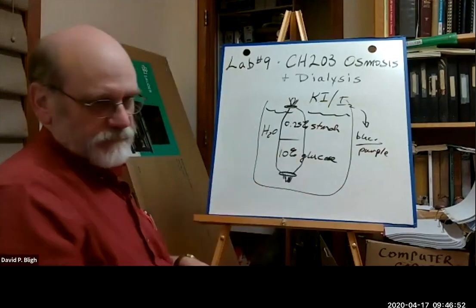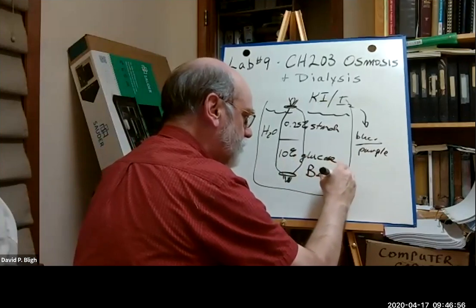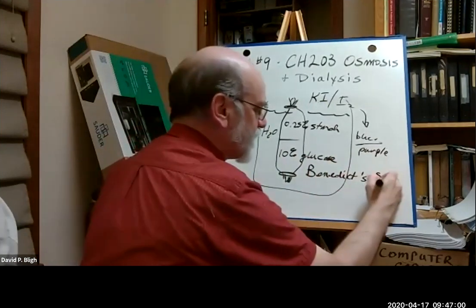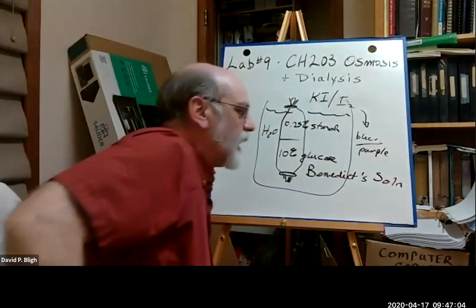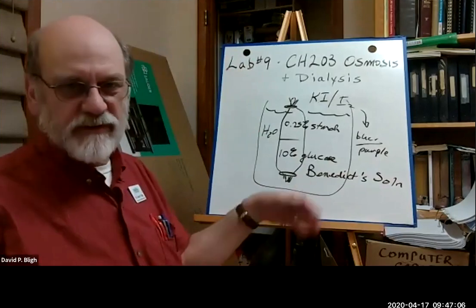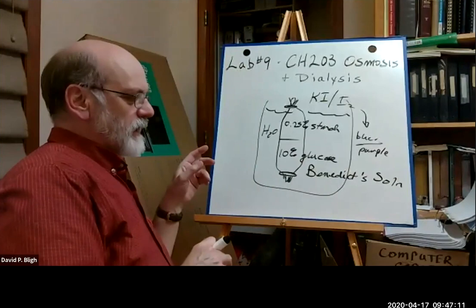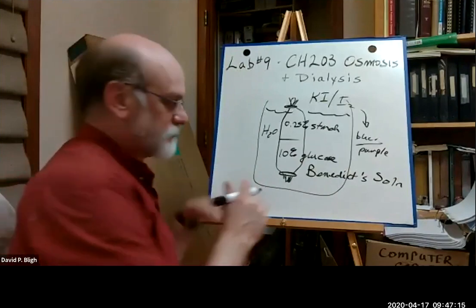For glucose, there's another solution called Benedict's solution. Now, chemistry there is a little complex too, but at the core of the chemistry is copper. Right?